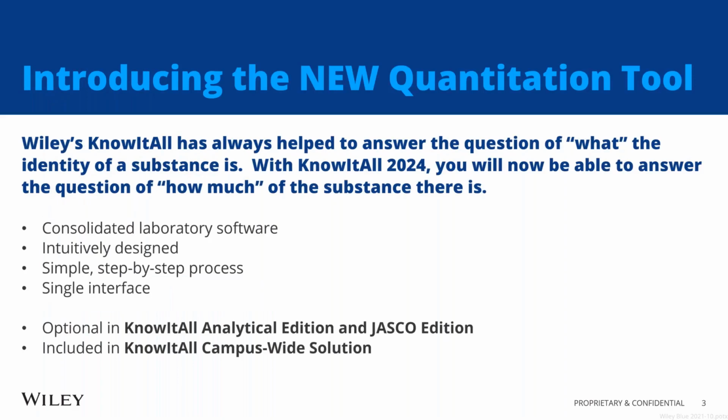So Wiley's KnowItAll has always helped to answer the question of what the identity of a substance is. In other words, qualitative analysis. But with KnowItAll 2024, you will now be able to answer the question of how much of a substance there is. In other words, quantitative analysis.